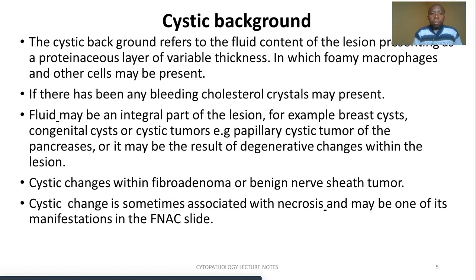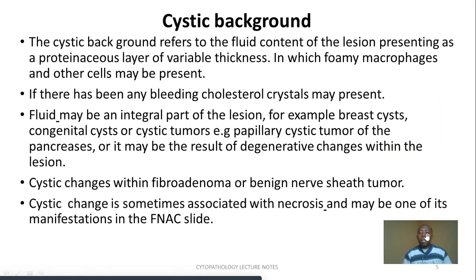So moving forward, let's begin straight away and look at the cystic background. And in this we said a cystic background refers to the fluid content of the lesion, which may be presenting as a proteinous layer of variable thickness, in which foamy macrophages and other cells may be present.